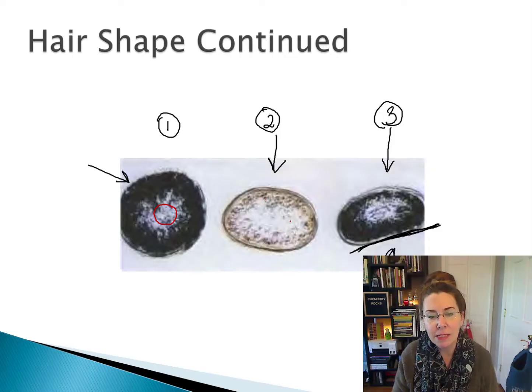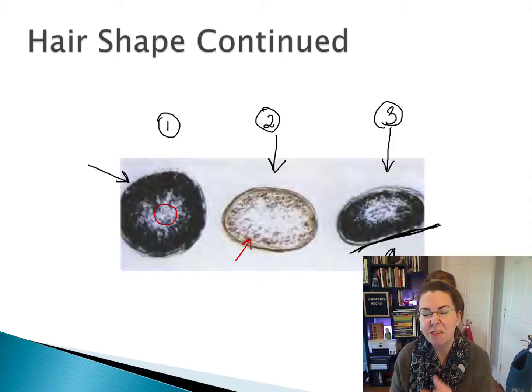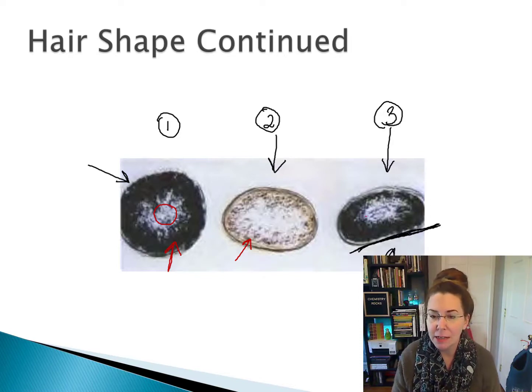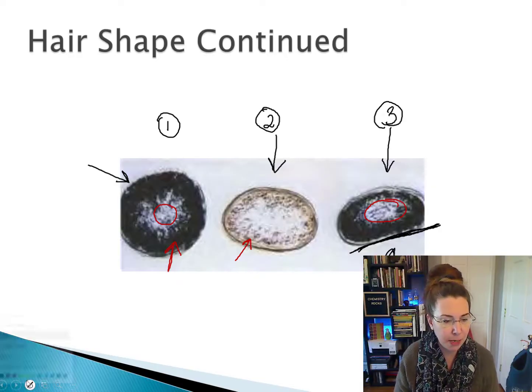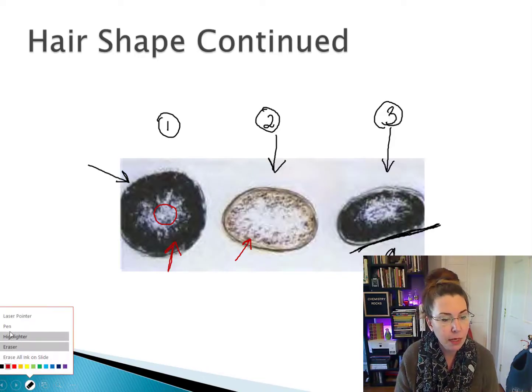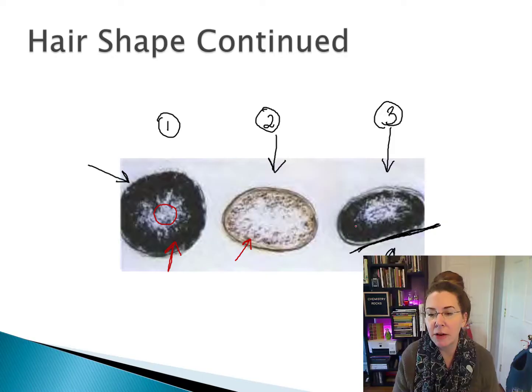In our second hair, the melanin is much less dense. The majority of it is pheomelanin — that lighter melanin. In our first hair, the majority would be the darker melanin, or eumelanin. In our third hair, you can see the central area that's primarily blank — that's where our medulla would be — and you have very heavy pigmentation to the outside, not quite as heavy on the curved side.